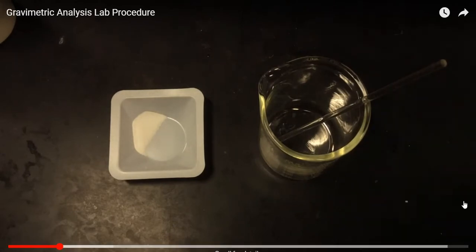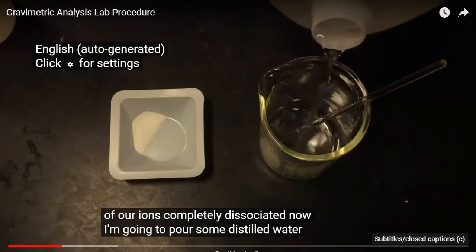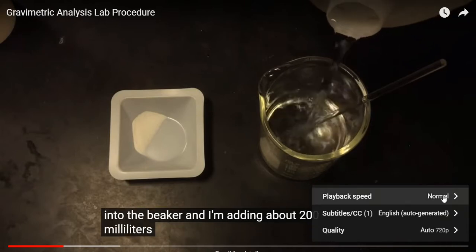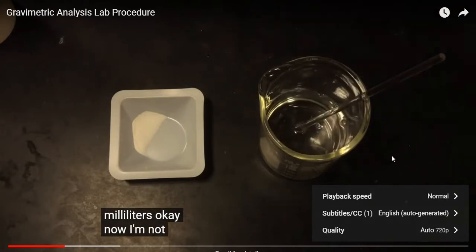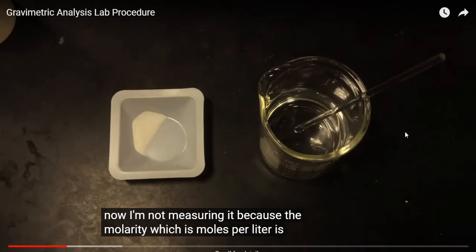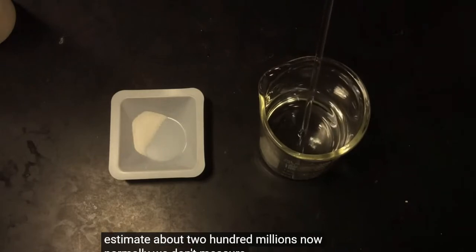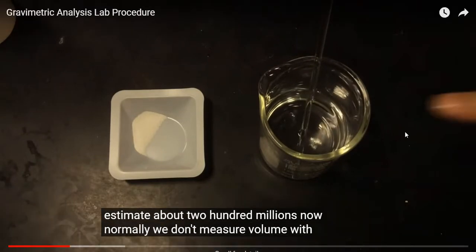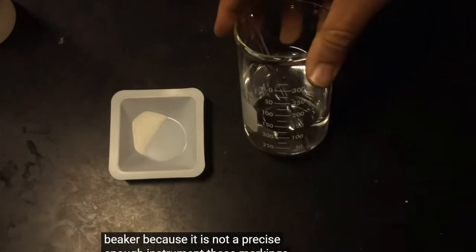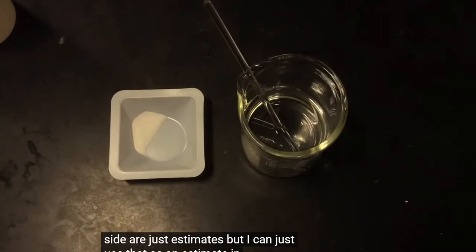Now I'm going to pour the distilled water into the beaker, and I'm adding about 200 milliliters. I'm not measuring it precisely because molarity, which is moles per liter, is not important here. So I'm just using an estimate of about 200 milliliters. Normally we don't measure volume with a beaker because it is not a precise enough instrument. These markings on the side are just estimates, but I can use that as an estimate in this case because, again, the molarity is not important.